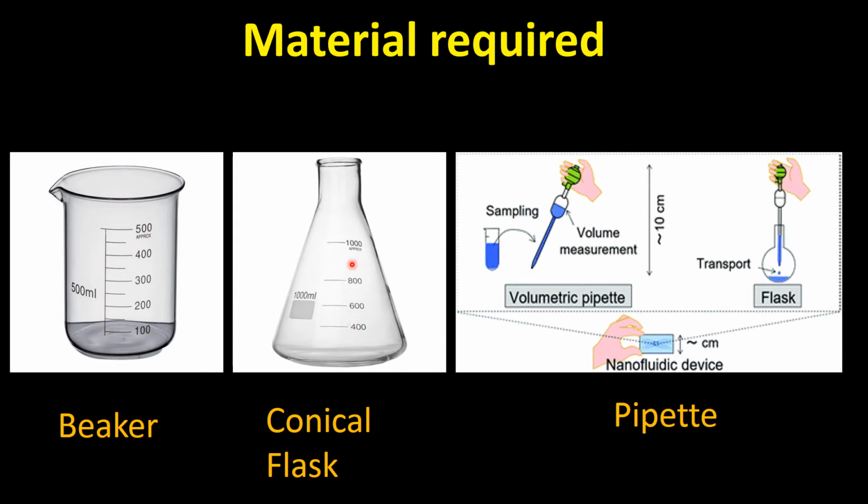As it is elongated and has a narrow mouth, most of the corrosive solutions will not move out of it easily while shaking or stirring.